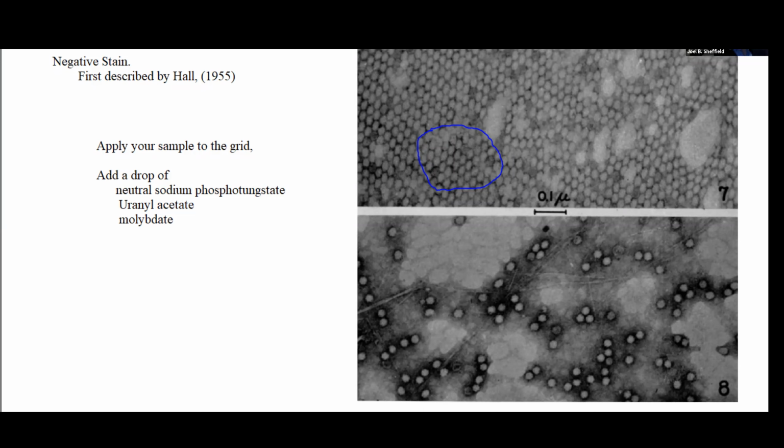So let me sort of finish my last bit here. After you add the drop, remove the drop, and allow to dry, okay? So that you still have a little bit of this stain left. And then you get this kind of interesting effect.